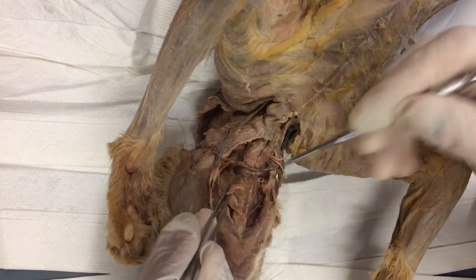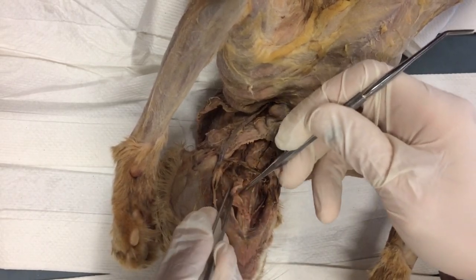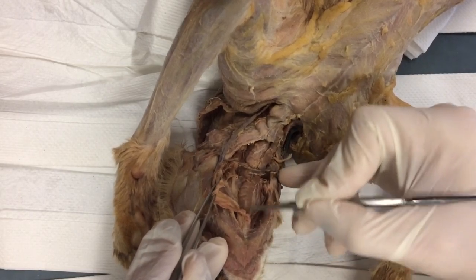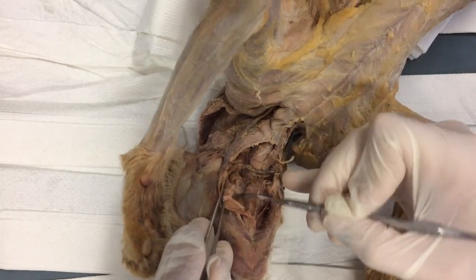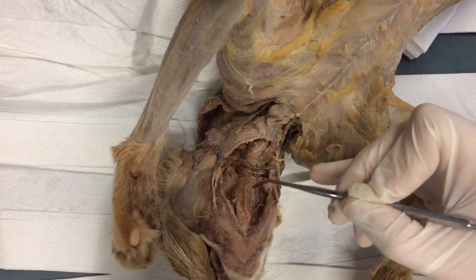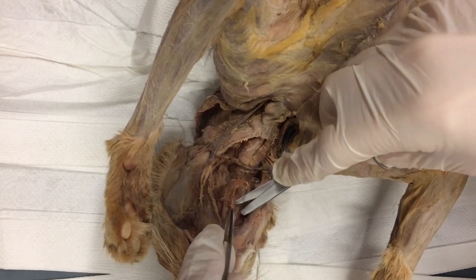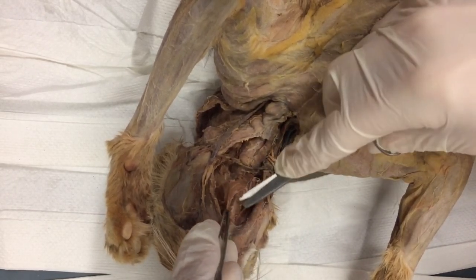Now to give me some relief, I'm gonna see if you pull on this too hard, this is gonna tear off. Now we gotta be careful. Just gentle gentle scraping. Round side. Ooh, look at this. See, and we're trying to protect those two tubes right there. Those are the Mylohyoids underneath. All right, I'm going back to my technique, and this is gonna get tougher and tougher as you come up here.